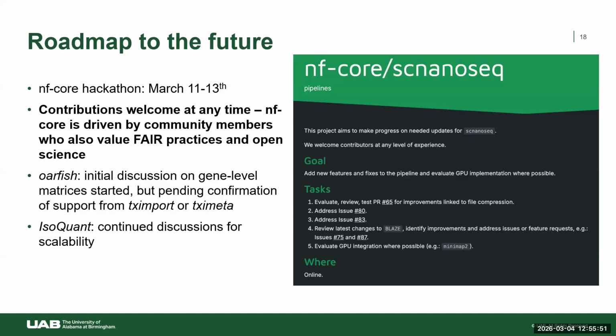And for IsoQuant, continue discussions on scalability. We'll continue to do that. Matter of fact, one more item that I'll add for the hackathon is just to upgrade it to the latest version, just to see if their parallelization has actually improved. And hopefully that will improve in the near future too.